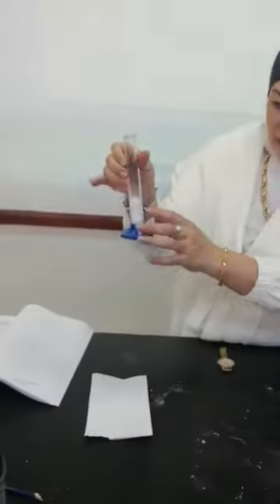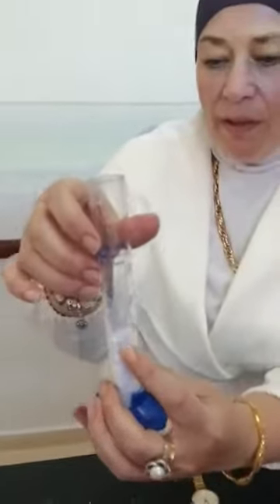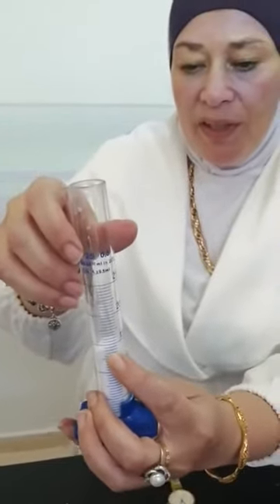After 2 minutes, we get a volume of around 14 ml.